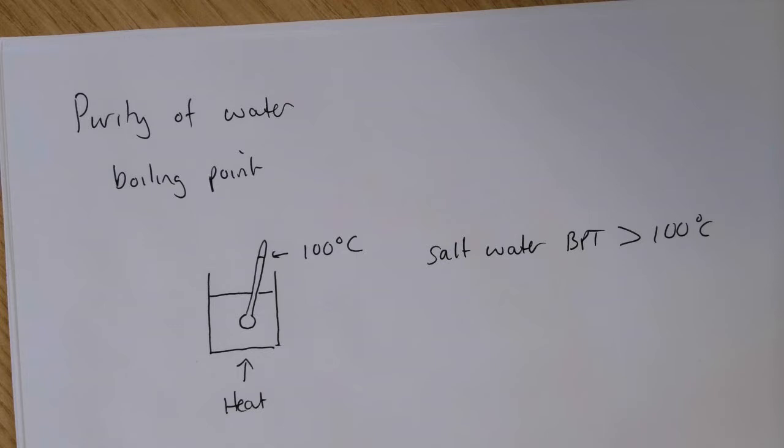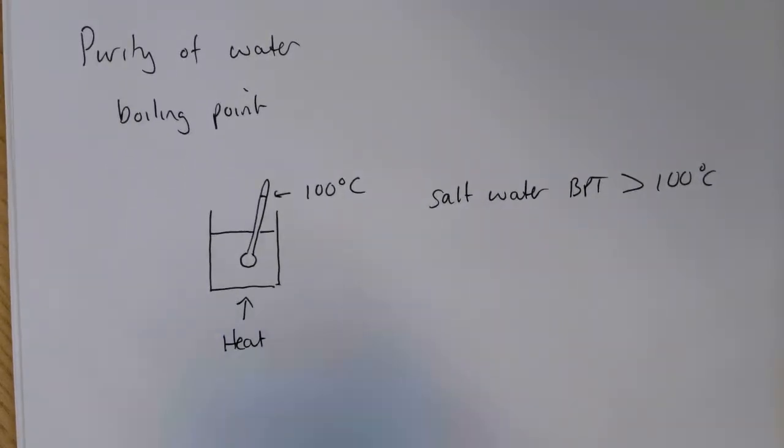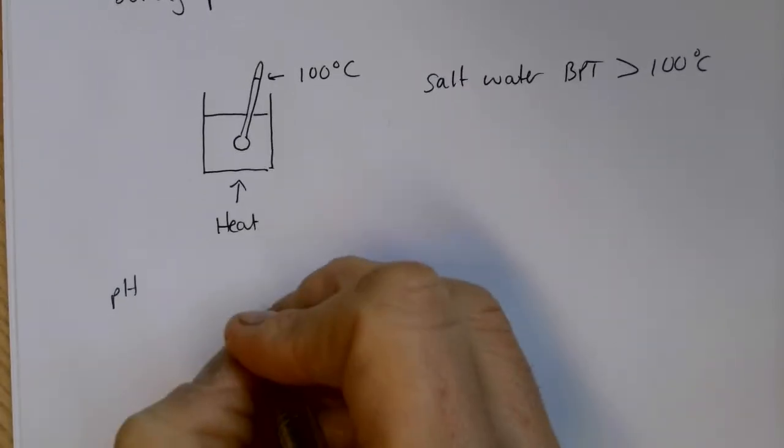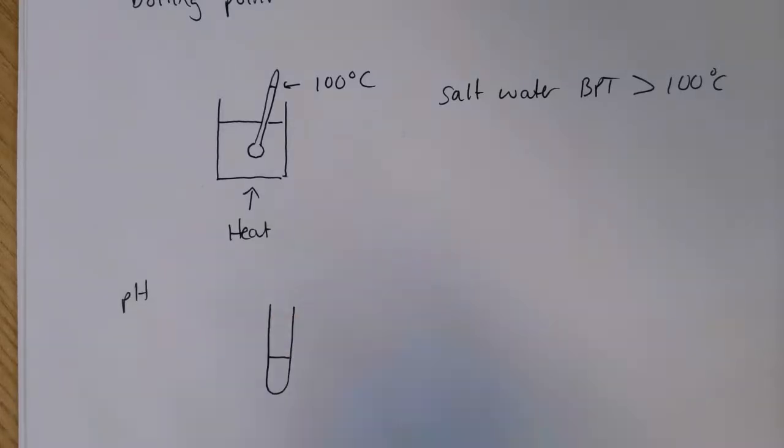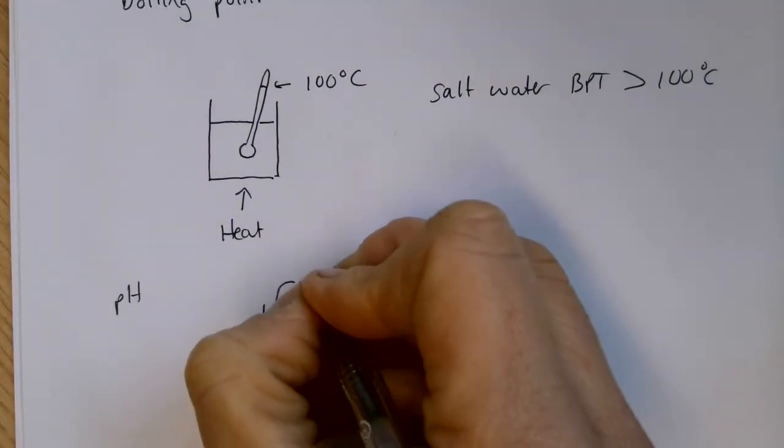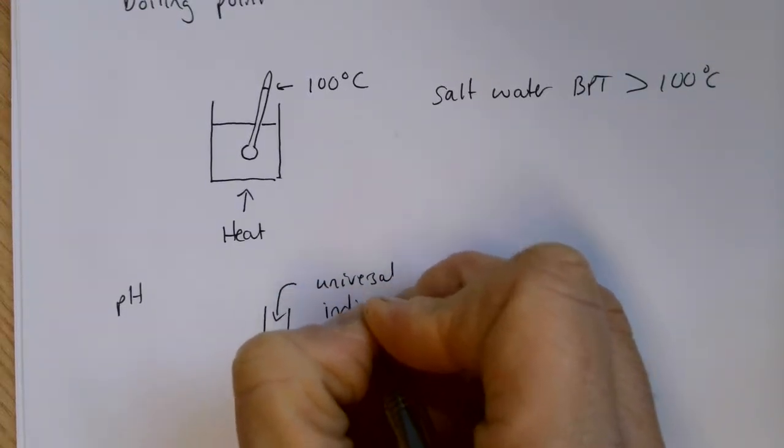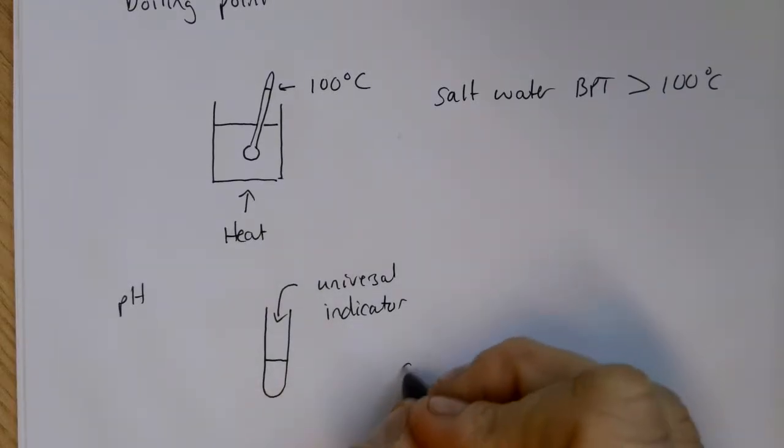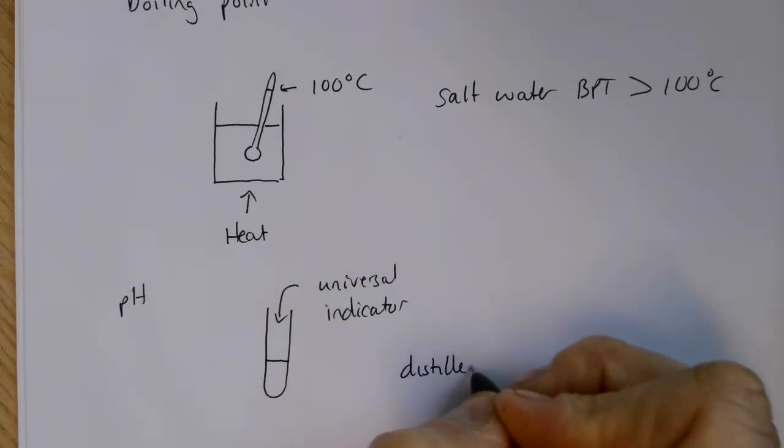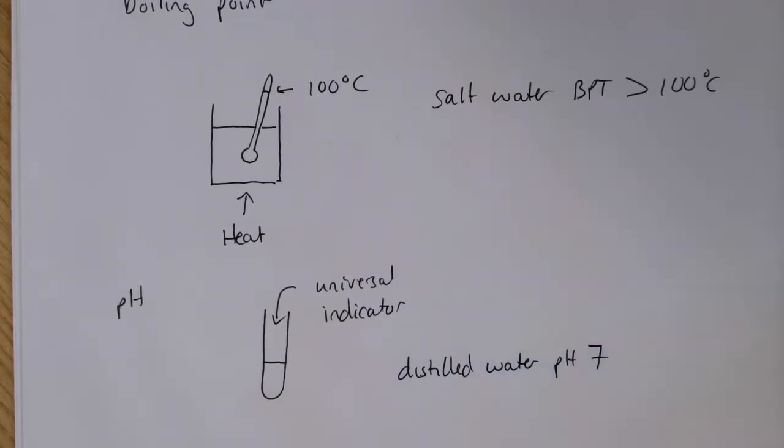We can also have a look at the pH of the water. The way that we would do that is to take our water sample, put it into a test tube, and add some universal indicator. We would expect distilled water to have a pH of 7, and therefore we would expect the universal indicator to turn green.